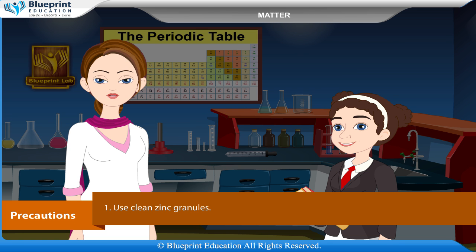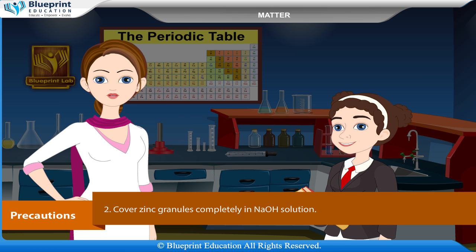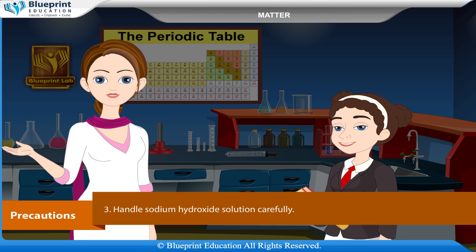Precautions. Use clean zinc granules. Cover zinc granules completely in NaOH solution. Handle sodium hydroxide solution carefully.